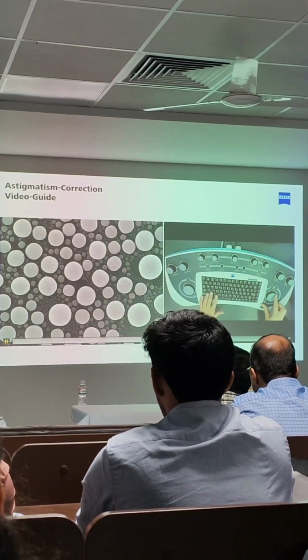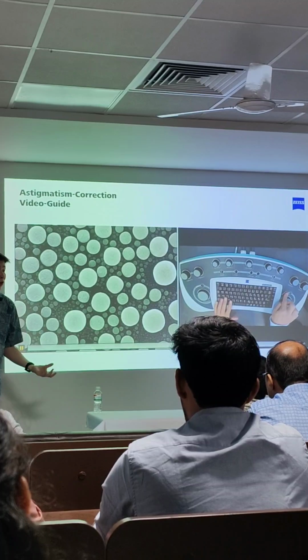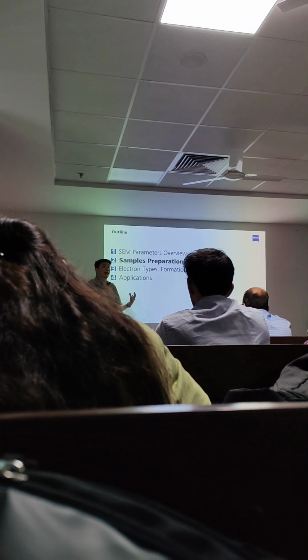A lot of students always come to me saying that I cannot take a good image, it's so bad, is my sample bad? No, it's just you don't know how to use the microscope properly. When you know how to do it properly, actually, you can extract the details, right, because once you have good samples, half of the battle is done.